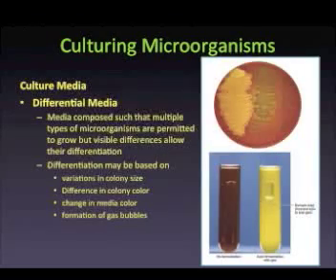Carbohydrate fermentation media contain a specific carbohydrate and a pH indicator within a nutrient medium that provides other required nutrients that support bacterial growth. In addition to the media, a Durham tube, a small test tube, is inverted within the media to serve as a trap for any gases that may be produced during fermentation.